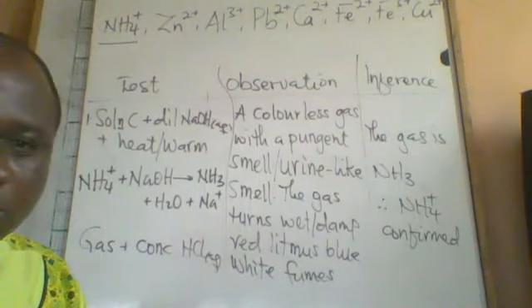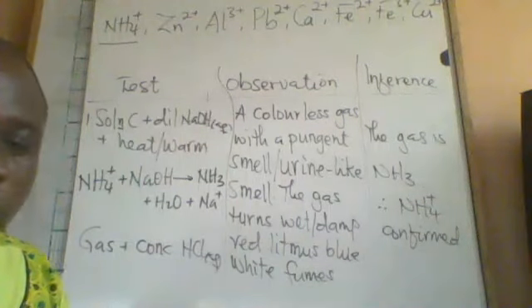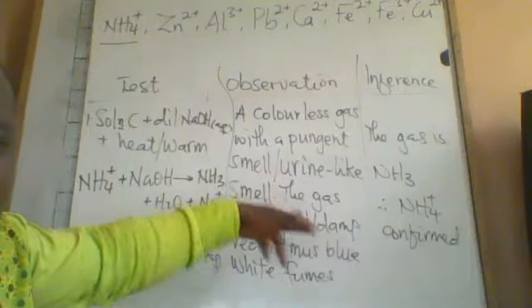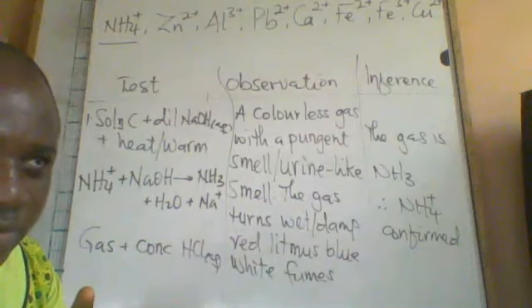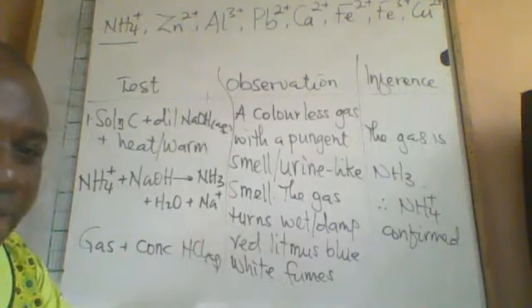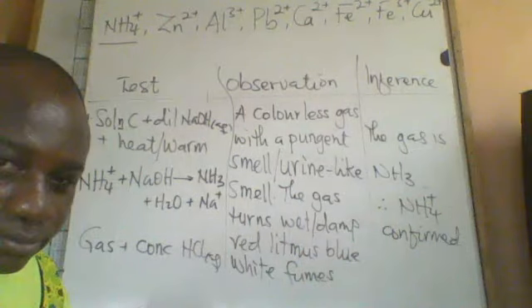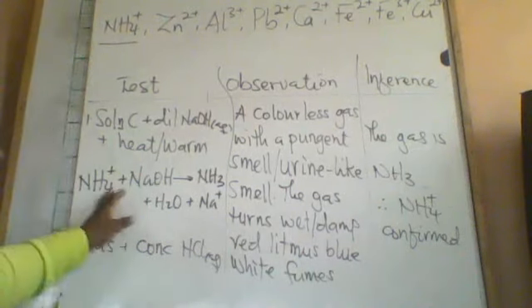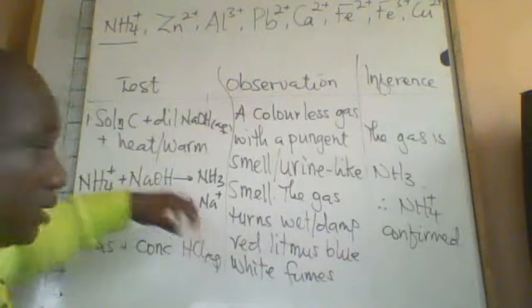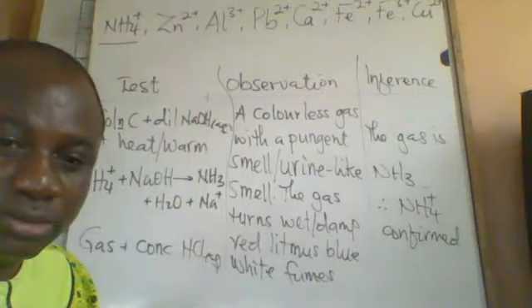Please, the ionic equation we were talking about, what was it? What I was trying to say is that what we are observing here is not magic. It is actually a chemical reaction occurring, and out of that reaction we observe what we see. When you add sodium hydroxide to a test solution that contains the ammonium ion, the ammonia gas will definitely come out.